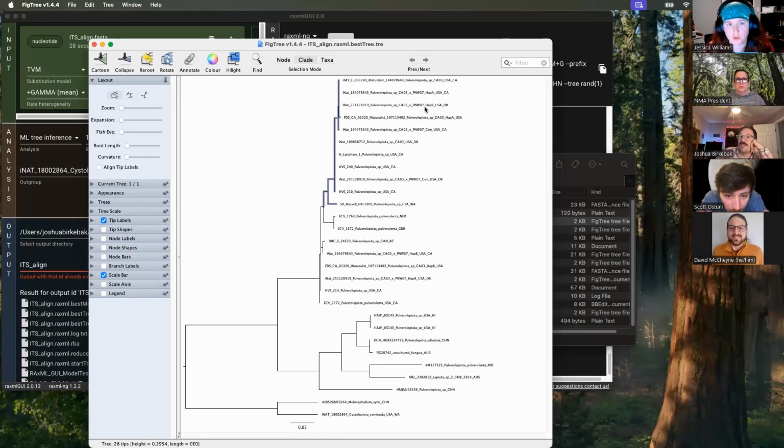If you took the haplotypes and put them in separately. Yeah, so I have both the consensus and each haplotype. What I want to do after this is cut out all of the consensuses and just look at the haplotypes, because I think that'll tell us something slightly different.